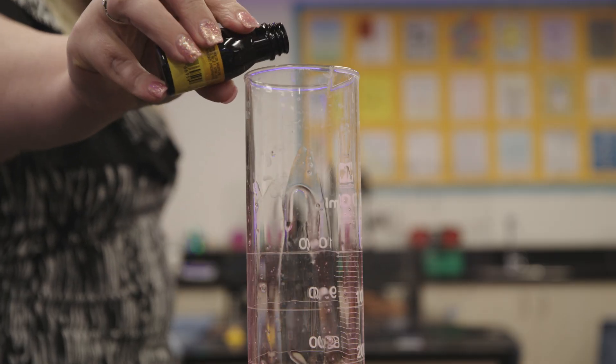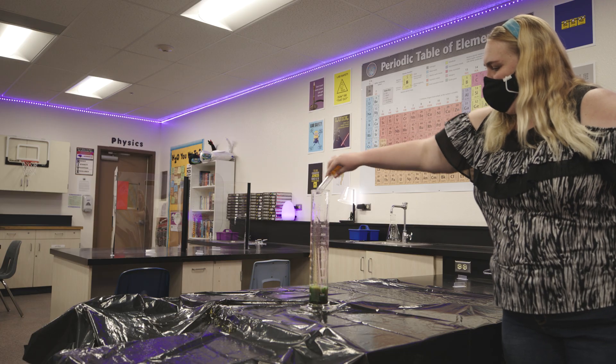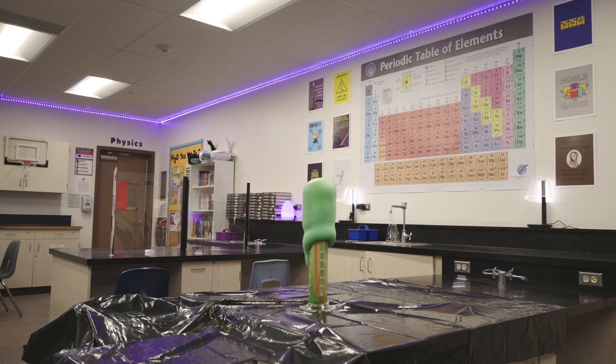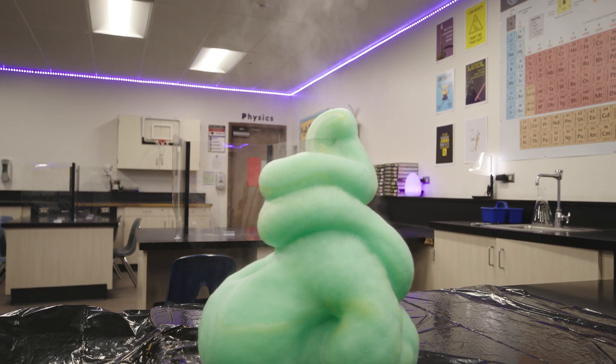As you're doing this experiment, what are some things that you are observing, whether qualitative or quantitative? How long is the reaction going for? How long did it take for the reaction to actually start bubbling and going up? Do you see smoke and how long does that last for? Those are some examples of quantitative data.